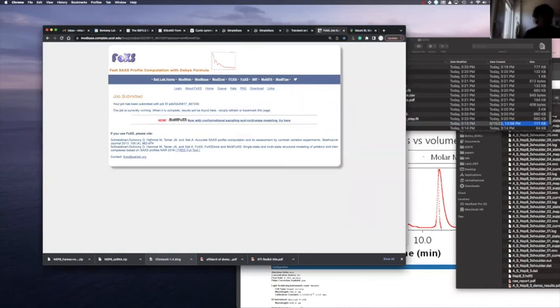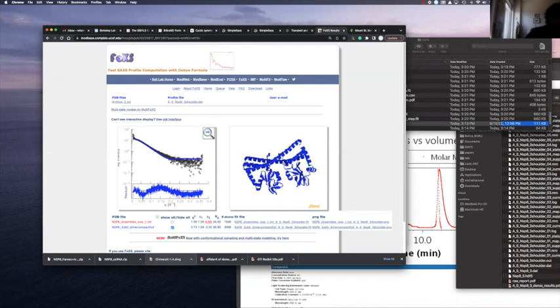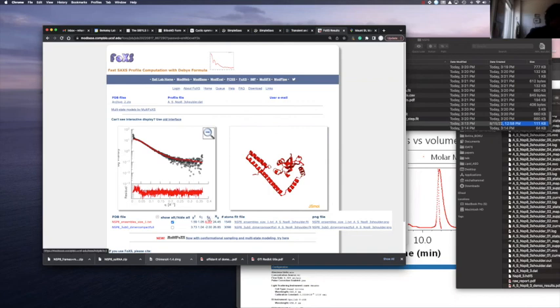And when you click submit, you will have directly a fit for those 2 files. One is the monomer and the second is the dimer. The dimer is from the crystal structure of a homolog. It's not exactly the same COVID-19 NSP8, it's a very similar coronavirus. And you can already see the monomeric state, the compact structure, fits the data almost nicely, but there is overfitting with this parameter called hydration layer, C2.